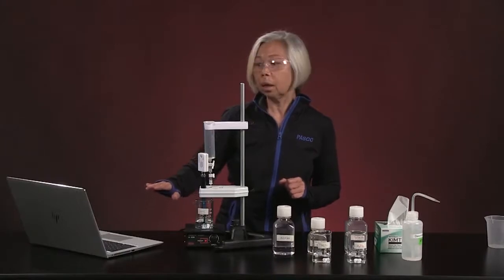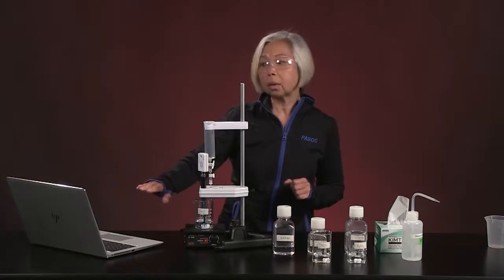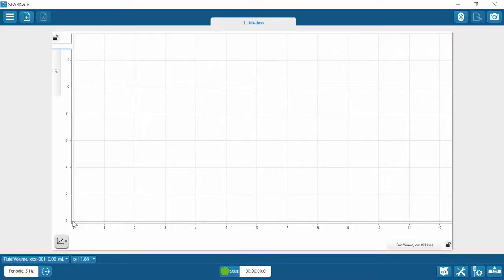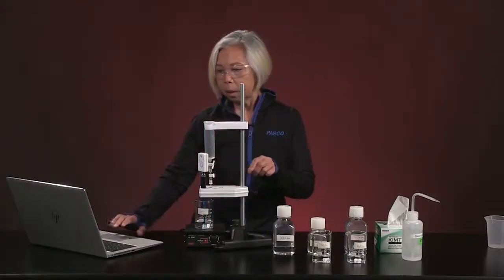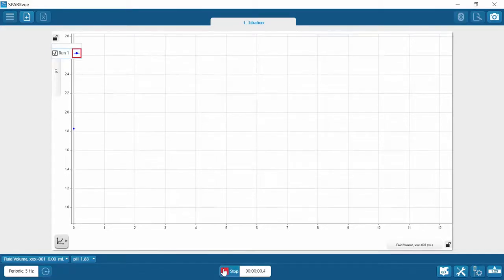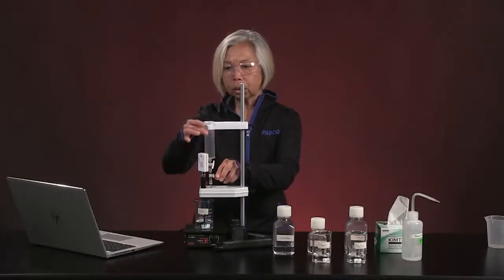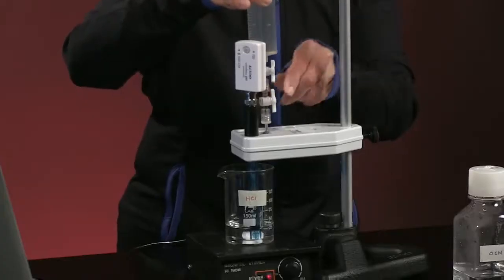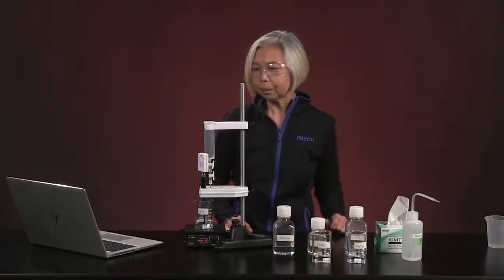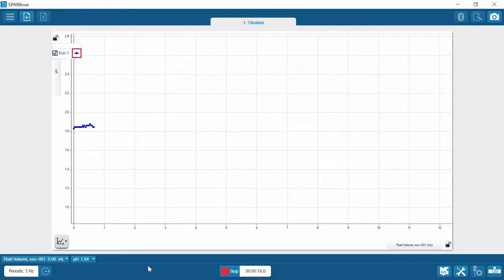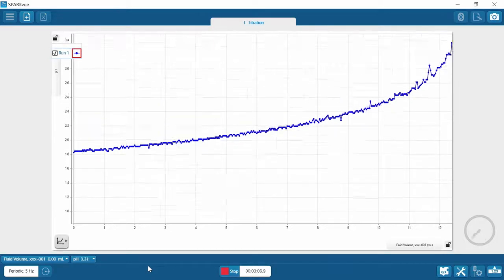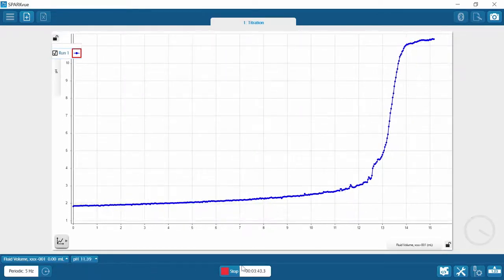This is the volume of sodium hydroxide being titrated in. Let's get started here. I will turn on the start button, but as you will see, no drops will be counted until I actually turn on the drops. We're going to be speeding through this collection process, so you can actually watch the curves being created. Our HCl titration is now done.